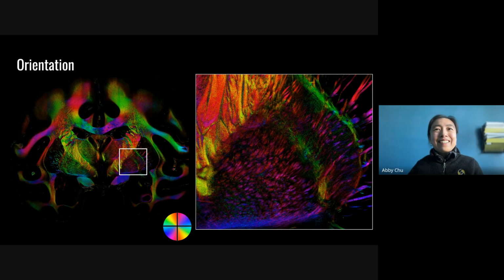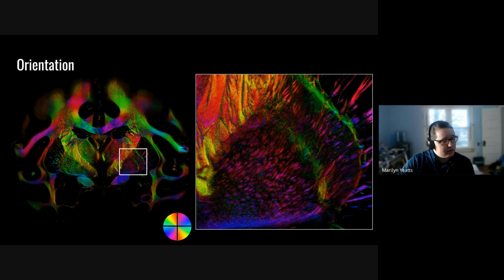Yes. All right. Oh, one other thing for clarity, just because I didn't really showcase it here. I do have these same en-face images for the entirety of this brain, from tip to tail, basically anterior to posterior. I've only showed one slice in this presentation for the sake of brevity, but I do have all of the slices of this brain if there is interest in that. That will be going out in a publication very soon.